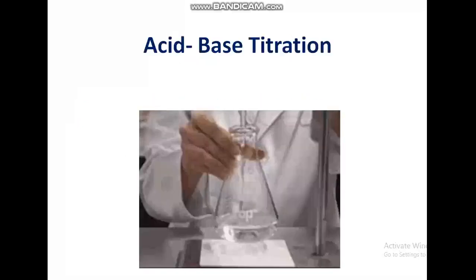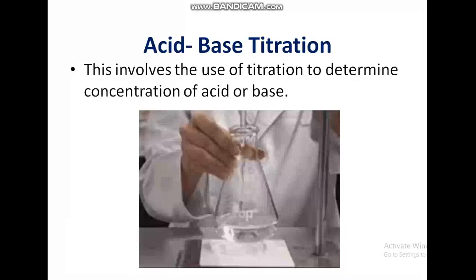We start with acid-base titration. This involves the use of titration to determine the concentration of an acid or base.